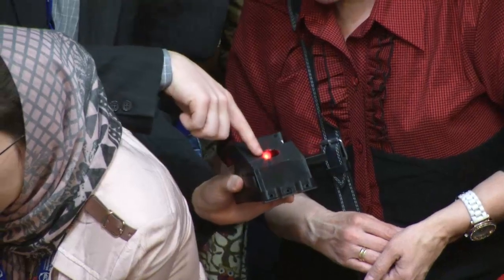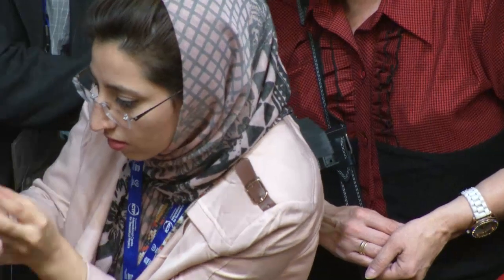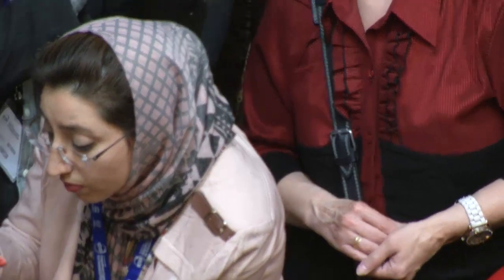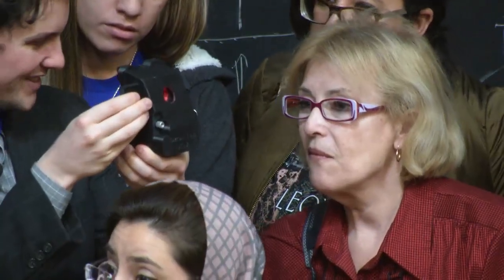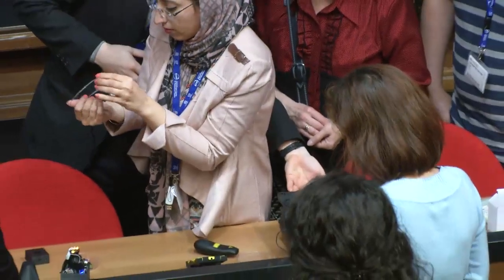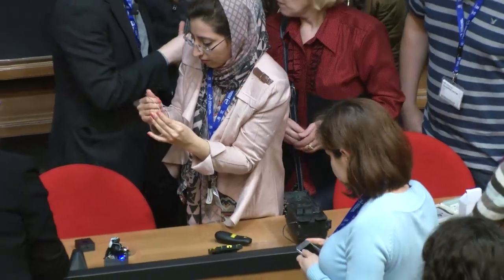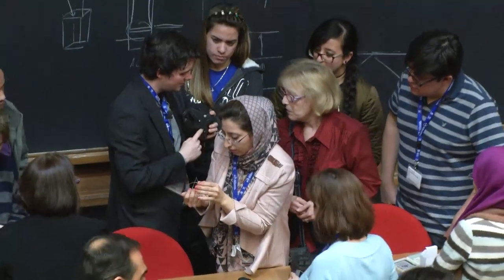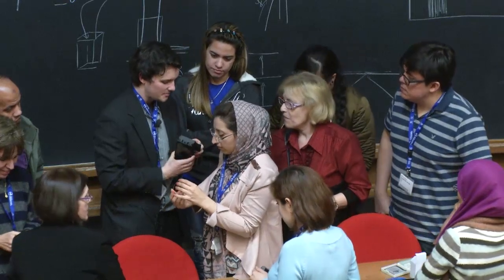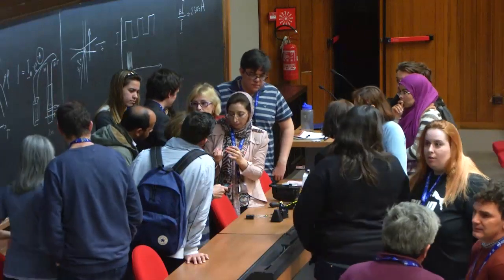That's here. You can see the emission filters. There's that square. And this hole is so that you can do bright field imaging by holding it up to the light and aligning your sample. And then when you're ready to do a dark field measurement, you just put it on the table and it covers the hole. And so this is the system for DNA imaging and sizing. It's battery powered. It eats batteries pretty quickly though, because it's a pretty high power laser diode. And then we have a knob here for focusing in the Z direction. And for waterborne pathogen.